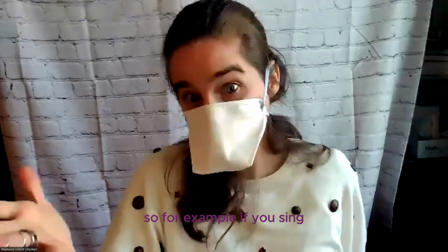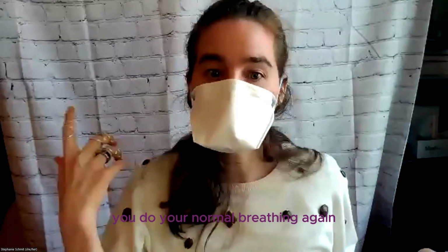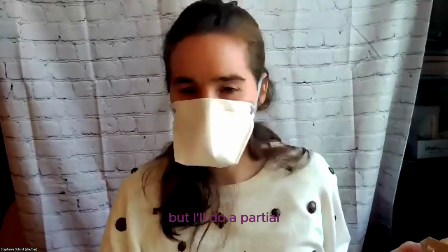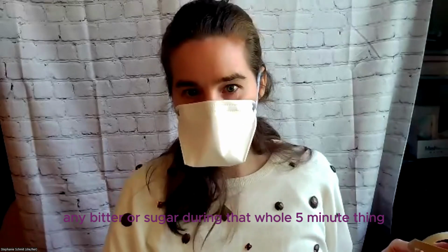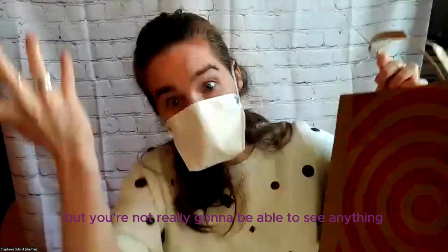So, for example, if you sing and you want to make sure your mask fits while you sing, you should sing while you're in the hood doing the test. And then at the end of all of that, you do your normal breathing again. And so that's all about 5 minutes. I'm probably not going to do it in real time, but I'll do a partial. And if you did not taste any bitter or sugar during that whole 5-minute thing, then your mask passes. All right, so I'm going to do that. I'm going to narrate, but you're not really going to be able to see anything.